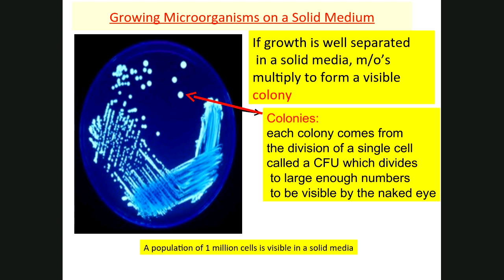So, for example, to make a pure culture of the organism in that colony, all you would do is transfer a sample of those cells into a nutrient broth, and after growth, that broth contains a pure culture. Okay. So the key is to be able to obtain isolated colonies. That is the key.